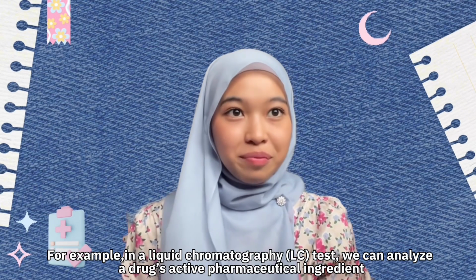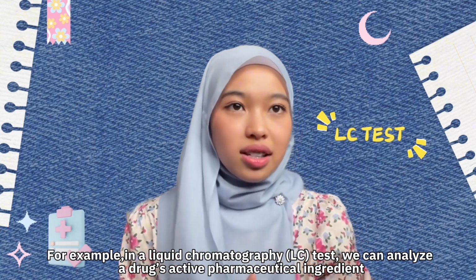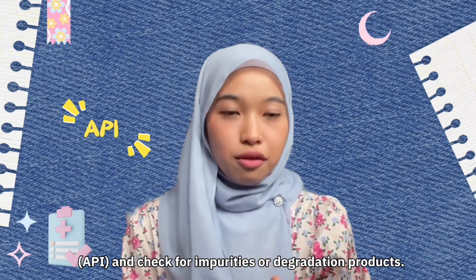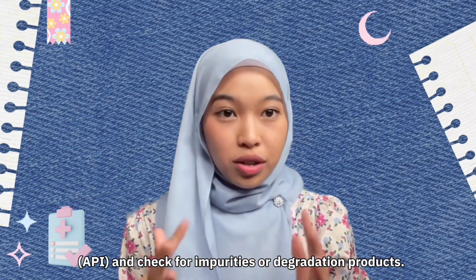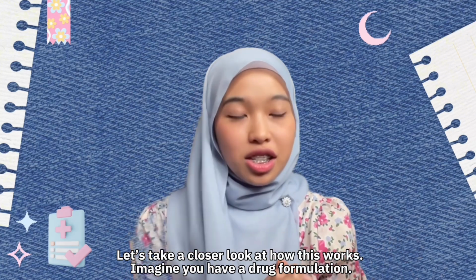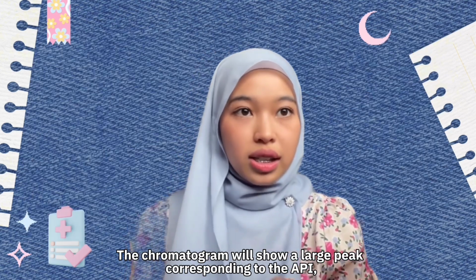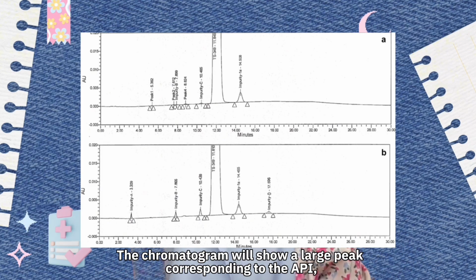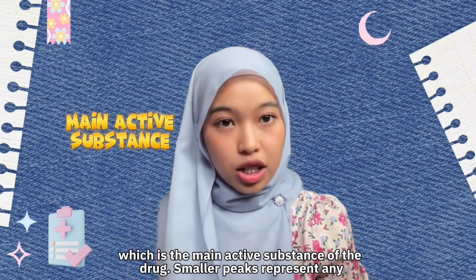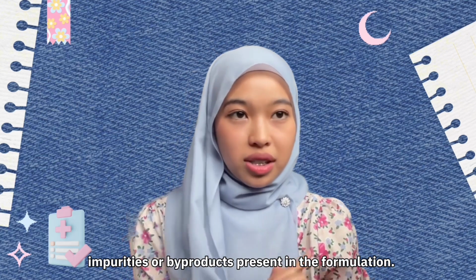For example, in a liquid chromatography (LC) test, we can analyze a drug's active pharmaceutical ingredient (API) and check for impurities or degradation products. Let's take a closer look at how this works. Imagine you have a drug formulation. The chromatogram will show a large peak corresponding to the API, which is the main active substance of the drug. Smaller peaks represent any impurities or byproducts present in the formulation.